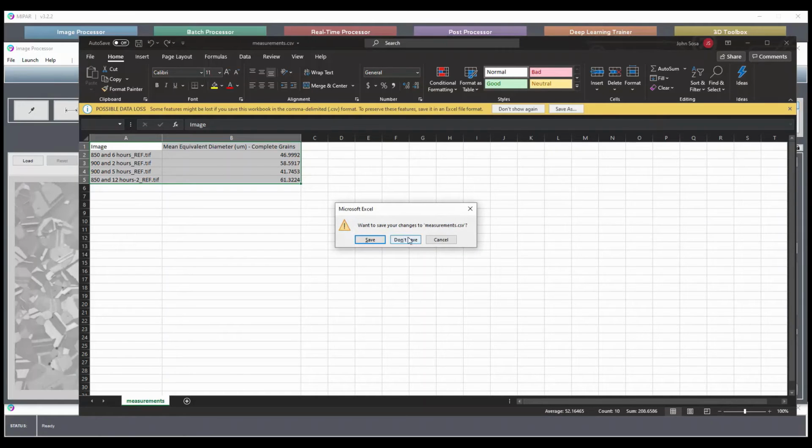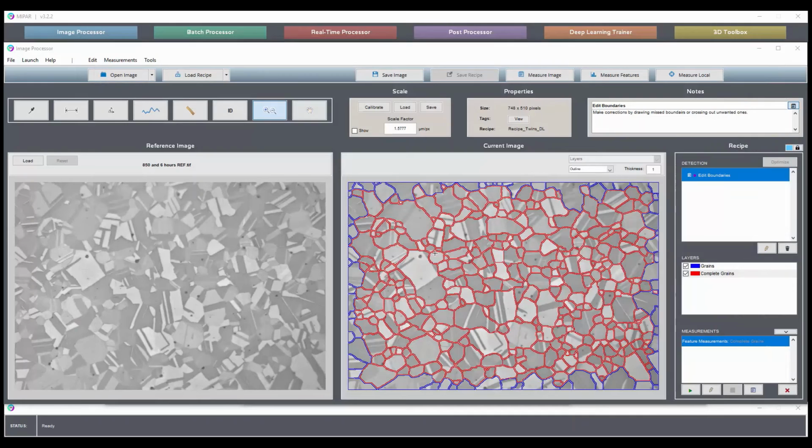But sometimes even if that's all the measurement you need, it's still very useful to supervise what was actually measured rather than just taking a spreadsheet and running with it.